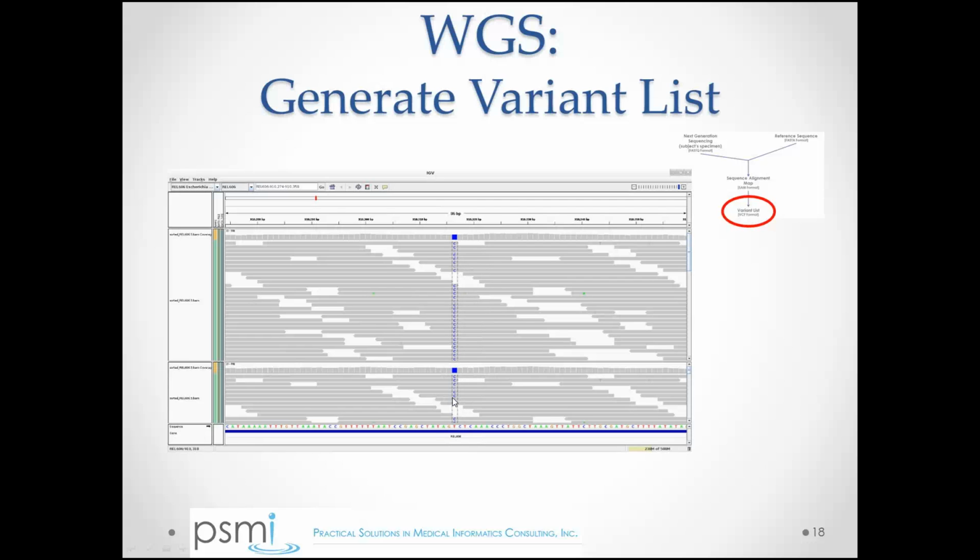You know, they have a C instead of a T. And you might also infer from this that it's a homozygous polymorphism, that both of their chromosomes have a C, whereas the reference DNA has a T. So looking for the SNPs, that seems to be pretty intuitive, how you could use software there.